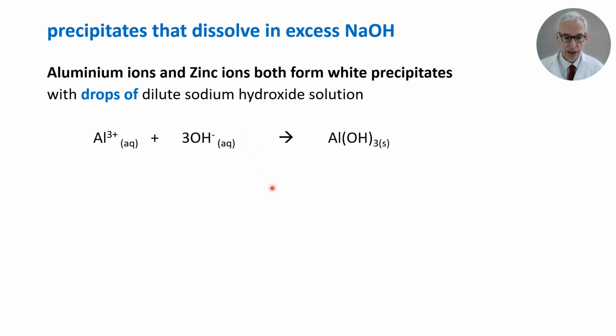Okay, so to reveal, the zinc is a 2 plus ion. It's a transition metal ion, so unless you know otherwise, treat it as a 2 plus ion. Therefore, it requires 2 hydroxide ions, 2 plus and 2 one-minus ions, to form zinc hydroxide, Zn(OH)2. State symbol s. So we've got zinc ion, aq, dissolved in water, plus hydroxide, OH minus, aq, gives zinc hydroxide, the solid precipitate, s.